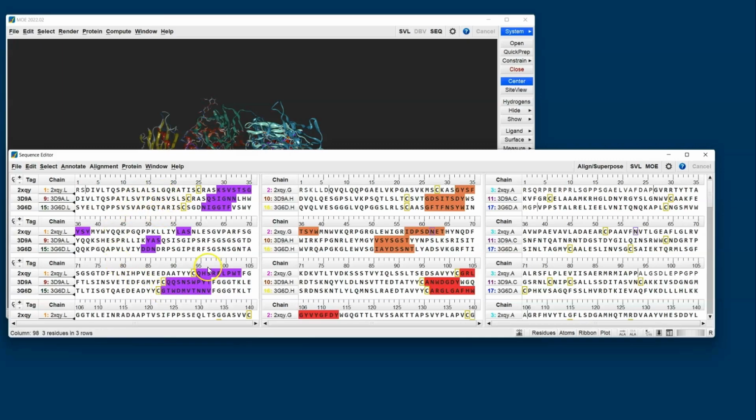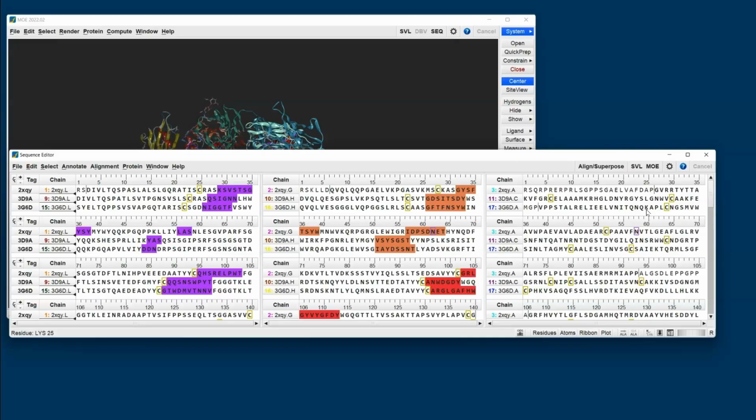By default, our light chain is displayed in the leftmost panel. That would be subunit 1. In subunit 2 sits the heavy chain, and everything else falls into subunit 3. Notice that the sequence has been colored to show us the CDRs.